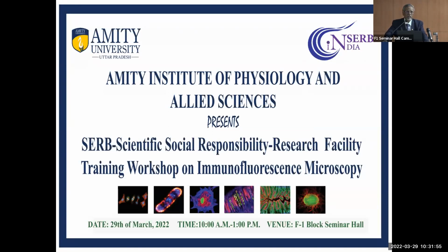To enhance that, there are several speakers who will be speaking on this specific subject and you will come to know this. It is not that it is easy, there are pros and cons, and precautions have to be taken, because if it is quenched, you cannot do it. What I was telling is that the Y chromatin is also very difficult, which is why you should be very experienced. It looks very easy, but when you go to do it you will face several fluorescences. Which one is right? It can be staining other material also. Only an experienced eye can do that, and it created havoc at the time of the Y chromatin and Barr body study I was explaining.